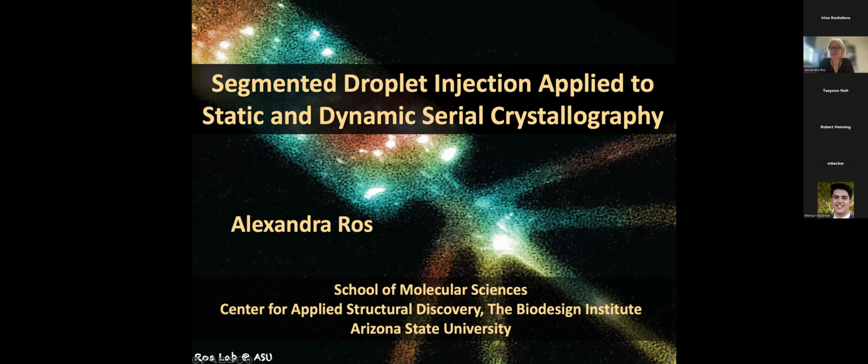I'm very happy to be able to present in this audience today since, as we just mentioned, we have extended our droplet injector applications to synchrotron sources lately. And so I will talk about crystallography. A big part of my talk will be on X-FELs, but then at the very end, I will go into our latest approaches that we have attempted at the ESRF synchrotron.